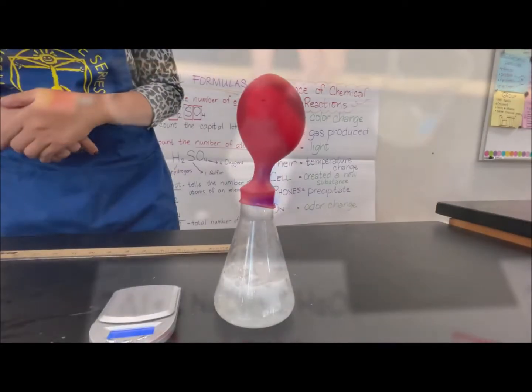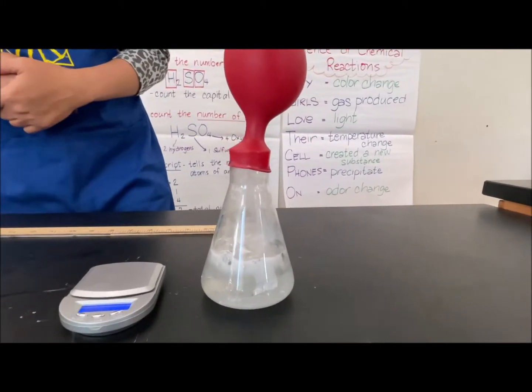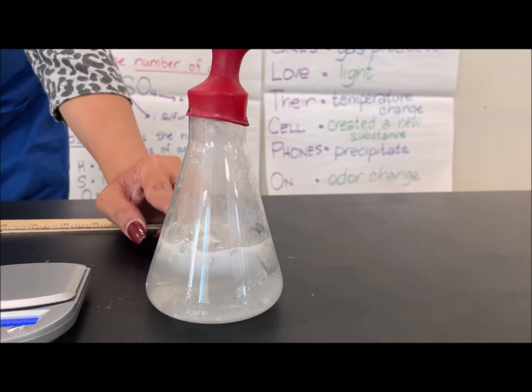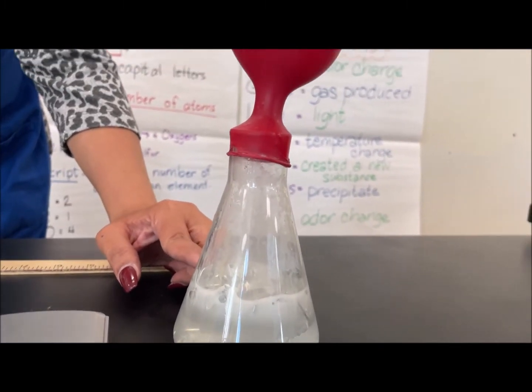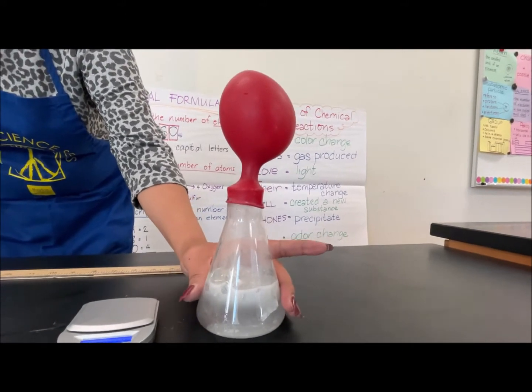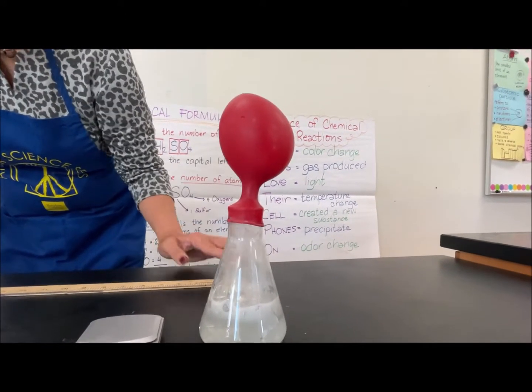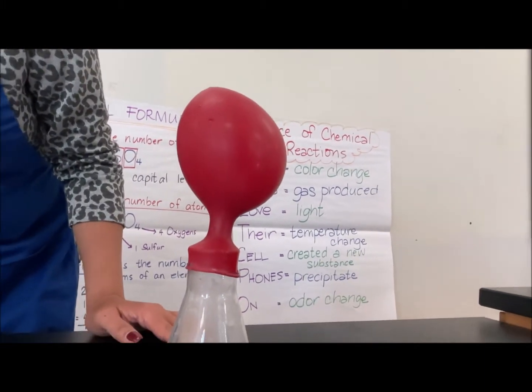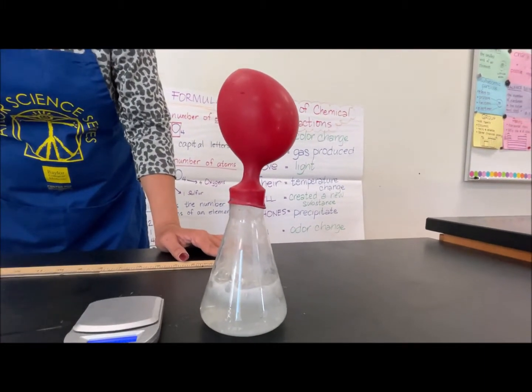Okay, so after a few minutes, we have some activities happening in our chemical reaction here. We can see it bubbling, and I can hear some fizzing sound, and it is also warming up. And we can see here that our balloon has already captured some gases produced by this chemical reaction.